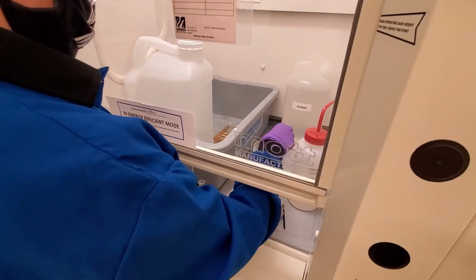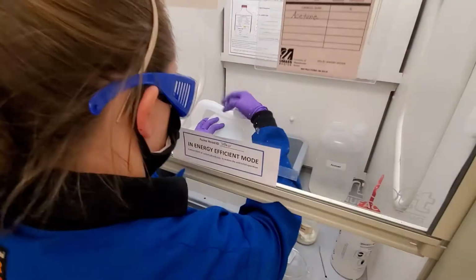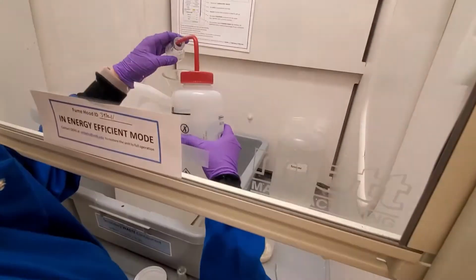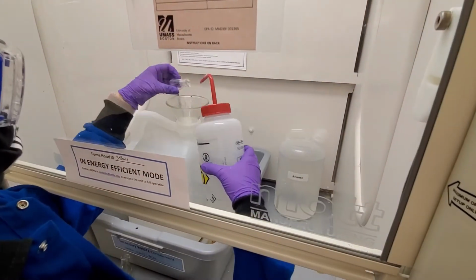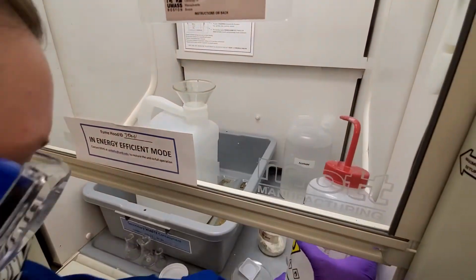Before we move on to analysis, we will clean up our lab space. Empty the liquid waste to the liquid waste container. Rinse the equipment with acetone in the liquid waste. Discard the sodium sulfate into the solid waste.